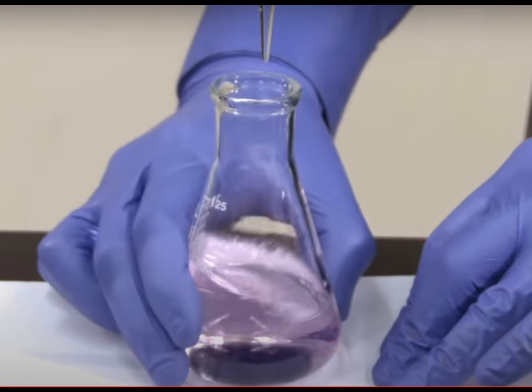Here's another example of a good endpoint. So he's not putting any more base in there. You can see that there's no liquid streaming out up here. He's just swirling it around a little bit. You can barely see the pink color, nice and light. That pink color may even disappear after a minute or so. That's what a proper endpoint looks like. So once he gets that nice light pink color, he knows, great, I'm done, I've stopped. I can figure out how much base I've put into this flask by reading the information off of the burette.